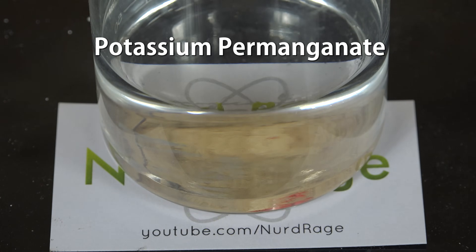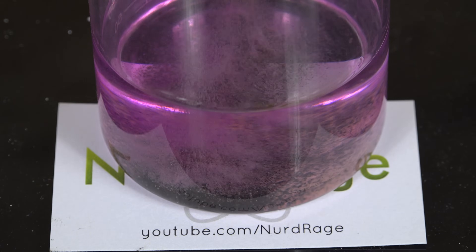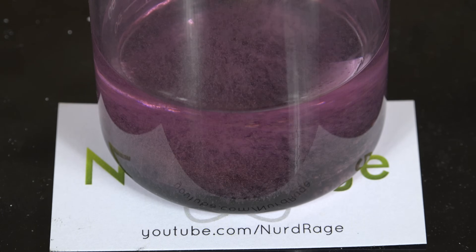Now for the fun part: get some potassium permanganate, about half a gram or so, and carefully sprinkle it in. It'll take a moment to get started, but eventually you'll hear popping sounds and see tiny flashes of light.